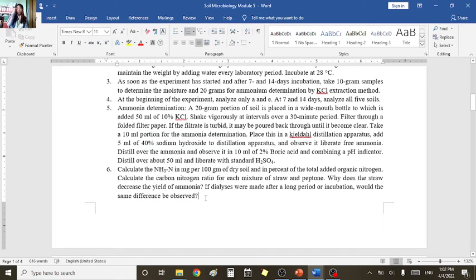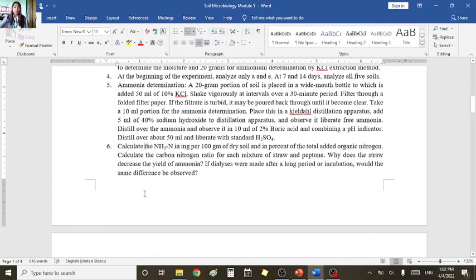I will be attaching a YouTube video link. Please watch that one so that you can relate to the Kjeldahl process of determining ammonia. We will not be doing this ourselves, and I won't explain it further, but you have to be aware of it, in case in the future you need it, so at least you have an idea. We won't calculate anything, but if ever you have data, calculate the ammonia in milligram per 100 gram of dry soil and in percent of the total added organic nitrogen.